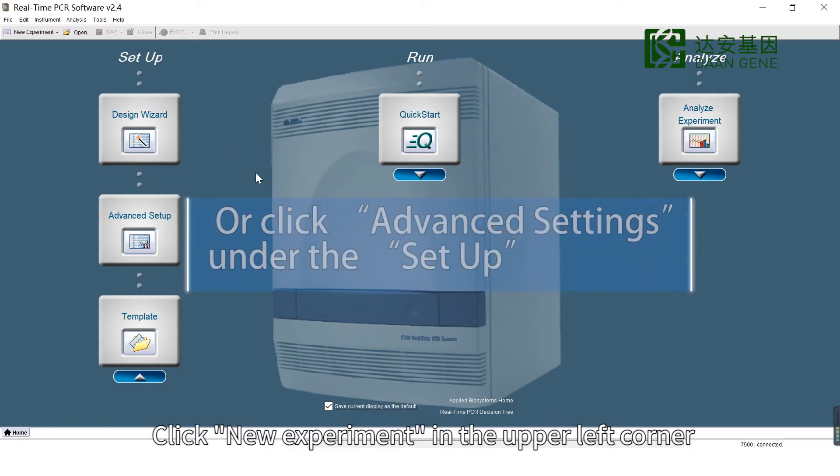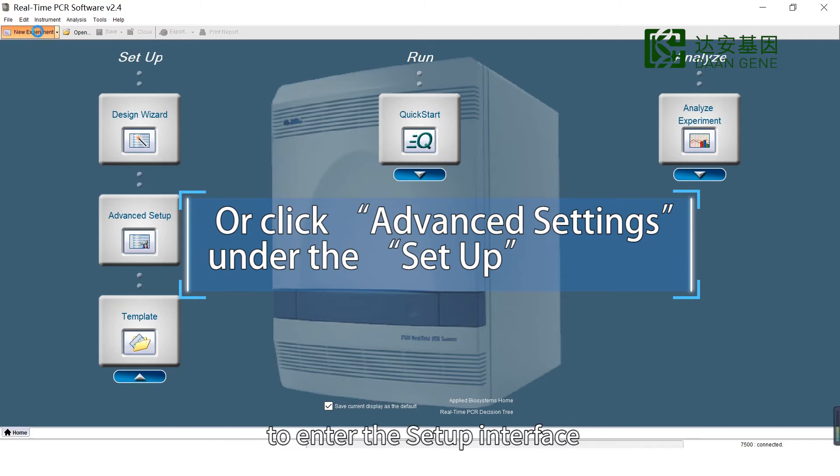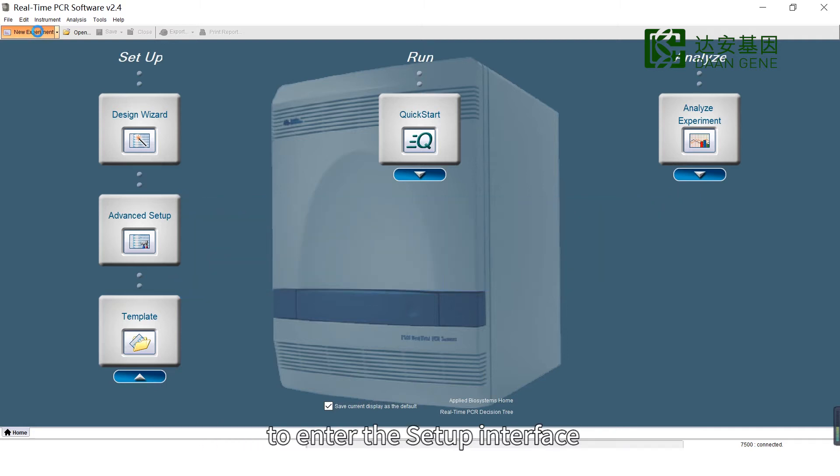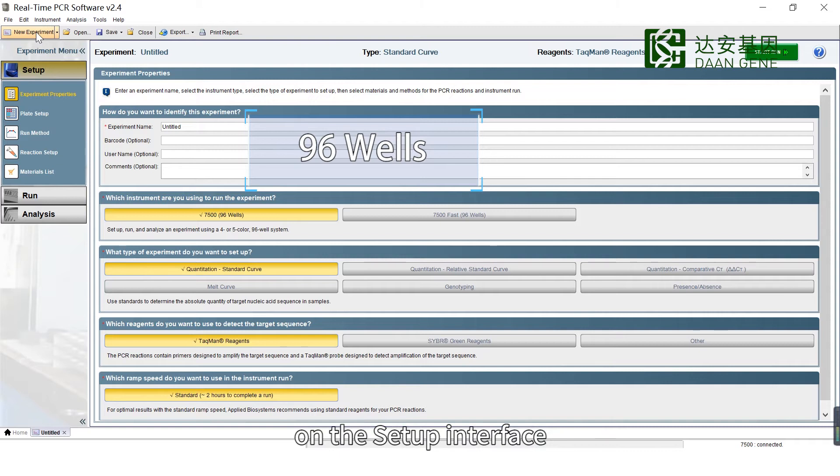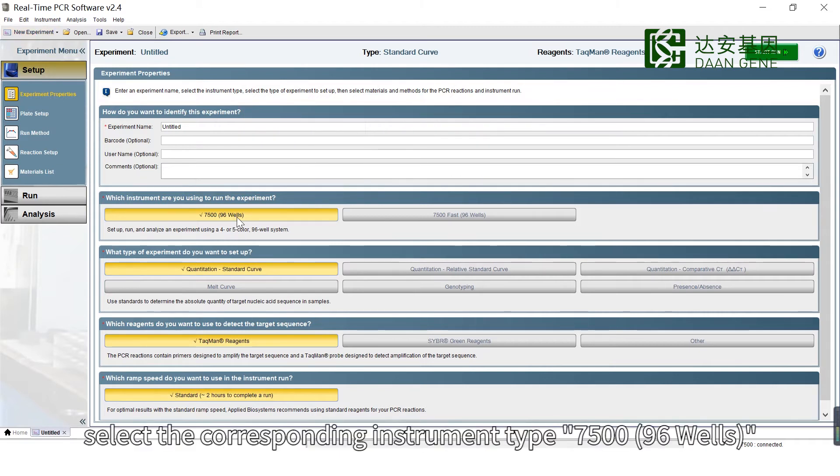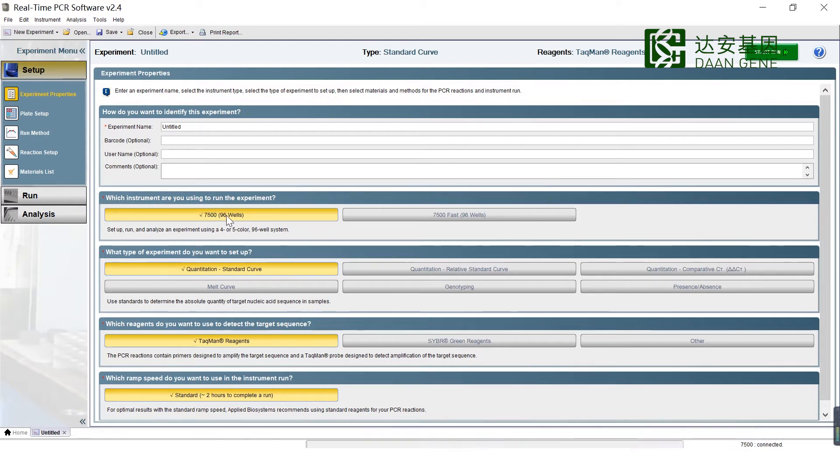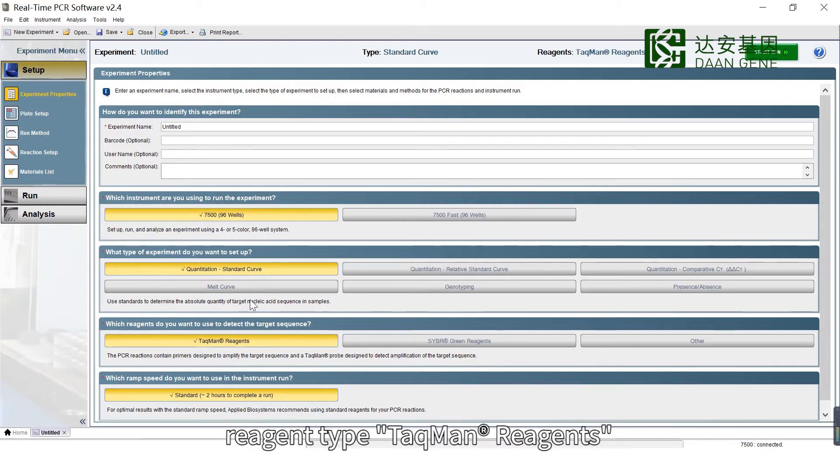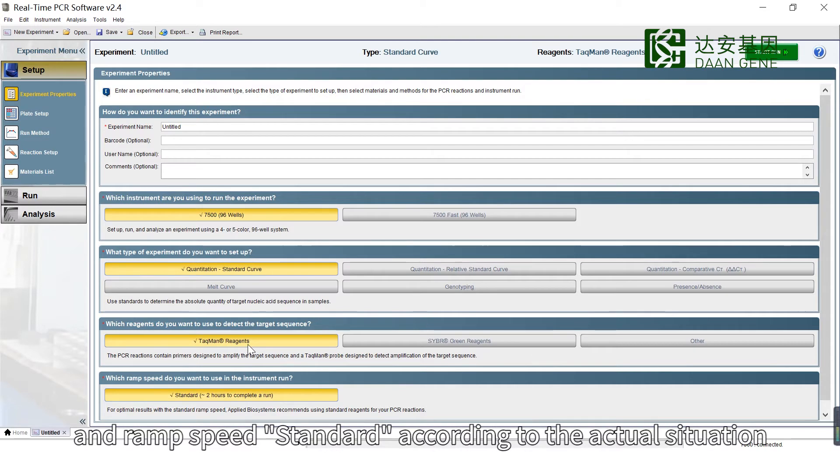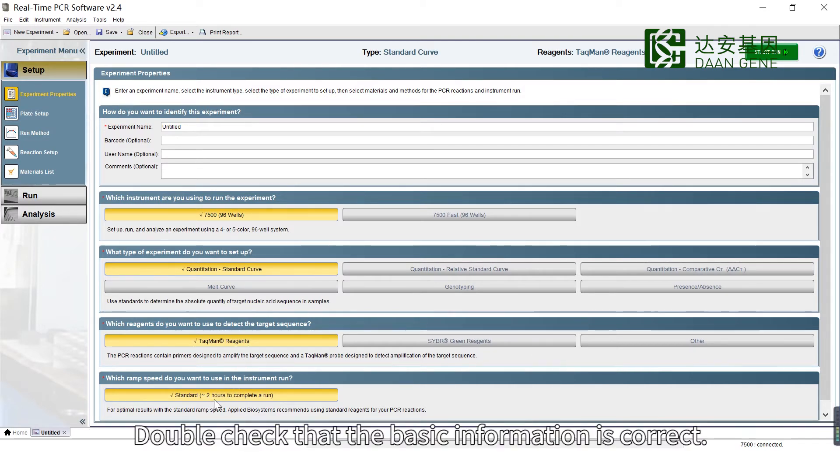Click New Experiment in the upper left corner to enter the setup interface. In the Experiment Properties column, select the corresponding instrument type (7500 (96 Wells)), Experiment Type (Quantitation Standard Curve), Reagent Type (Taqman Reagent), and Ramp Speed (Standard) according to the actual situation. Double-check that the basic information is correct.